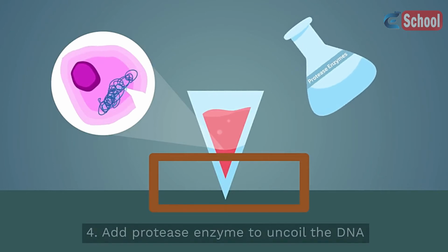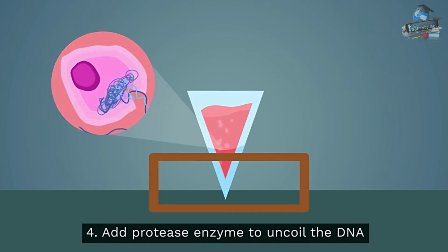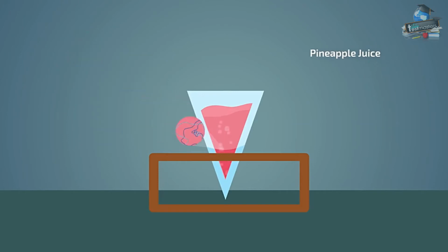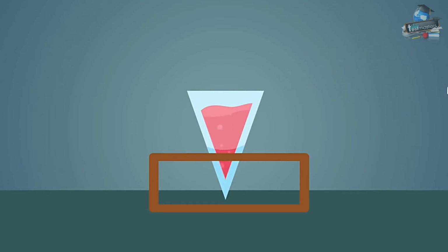Adding a pinch of protease enzyme will help break down the proteins the DNA is wound tightly around. The DNA will uncoil and will now be present in the mixture as long strings. You can use pineapple juice, contact lens cleaner, or a pinch of meat tenderizer. These all contain protease enzymes.